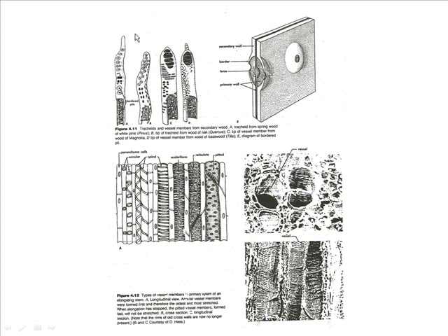Up here at the top, we have both kinds we've talked about so far. The two on the left are what? Tracheids. The two on the right are vessels. And again, you have a pit pair showing how water gets from one cell to the next, not one vessel to the next, but one what to the next? One tracheid to the next.